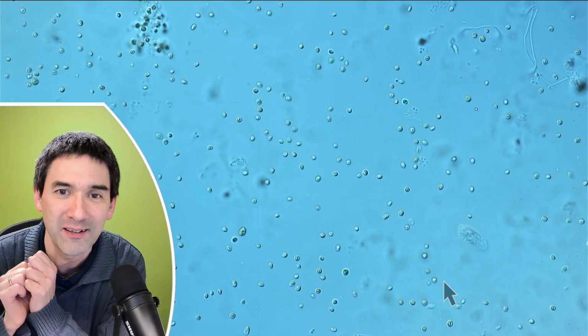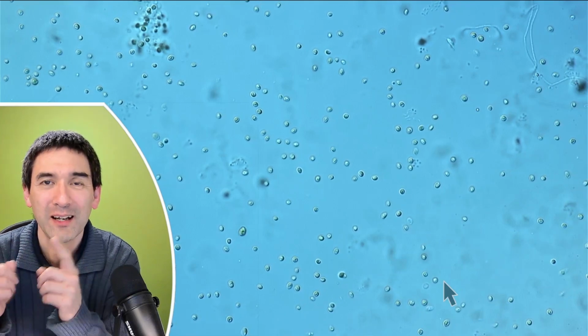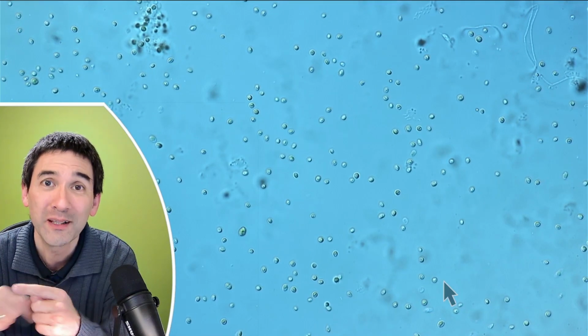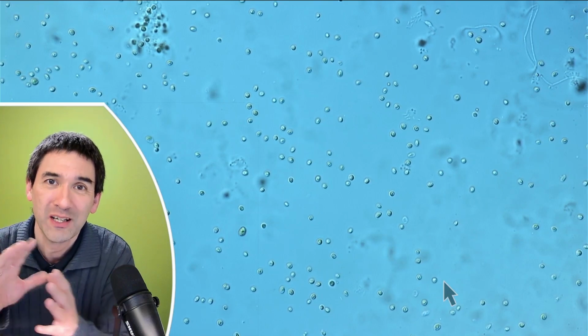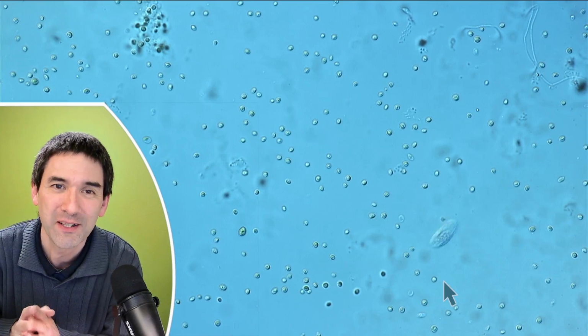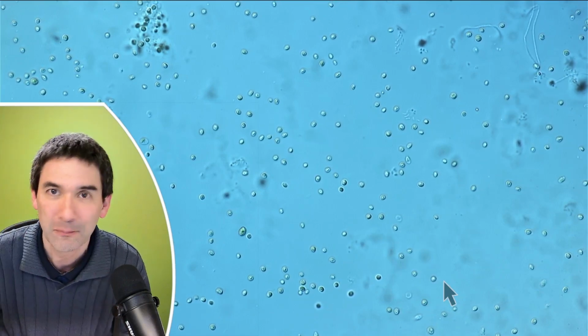Look, here's a ciliate. Yeah, that's also an example of directional movement. Okay, and then at the end of the video, I'm going to talk a little bit about the random movement, also called kinesis and taxis in microorganisms, because it also has to do something with movement, but it's again a little bit different. But actually, it also kind of fits into this topic here. Look, another ciliate over here. Okay, so now let's have a look at some milk.